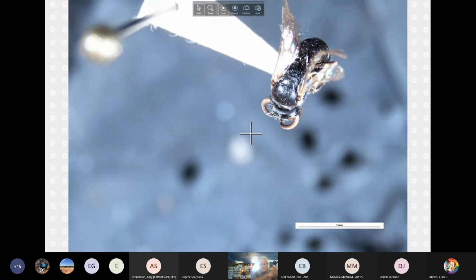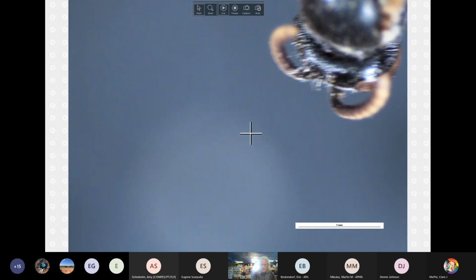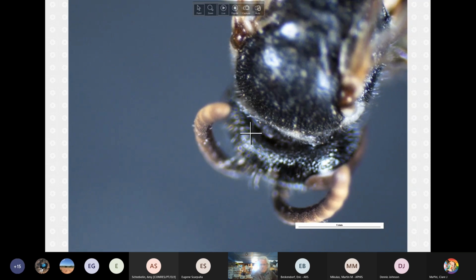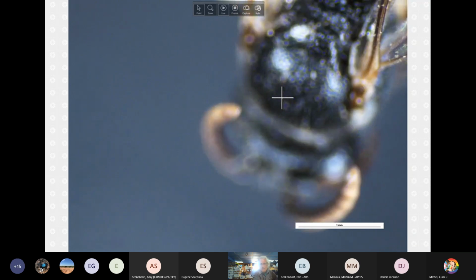I would think it wouldn't be so variable, given that it probably only came over with a few specimens, but this is a good illustration: the amount of light area in the pronotal collar seems to vary from nothing to a small amount to a fairly large amount. So that's something to be aware of.